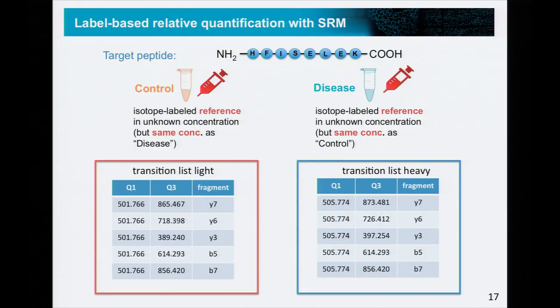And then we need to measure this peptide, right? The difference to label-free is that we now do not only need the transitions of the light, but we need to add also the transitions of the heavy peptide. Otherwise, we would not get any information for that. So by doing isotope-labeled quantification, our transition list will increase by a factor of 2. Sometimes this can be an issue, and you then need to split transition lists into 2 runs because it is no longer possible to measure all of them in one go.